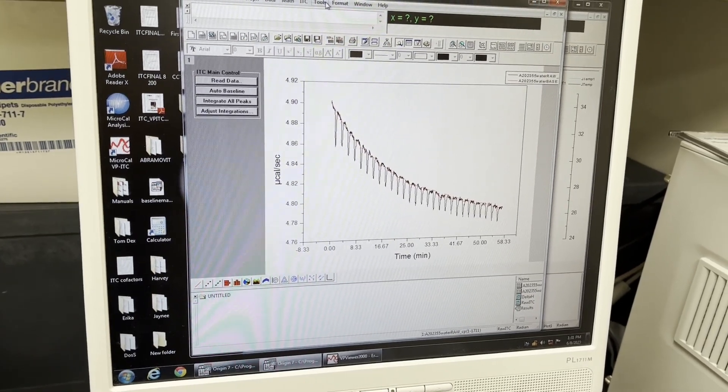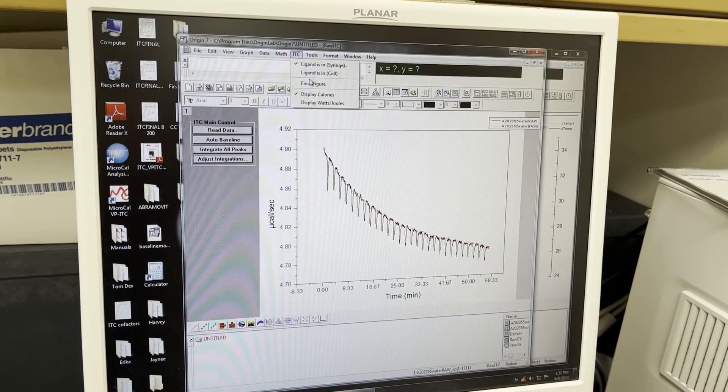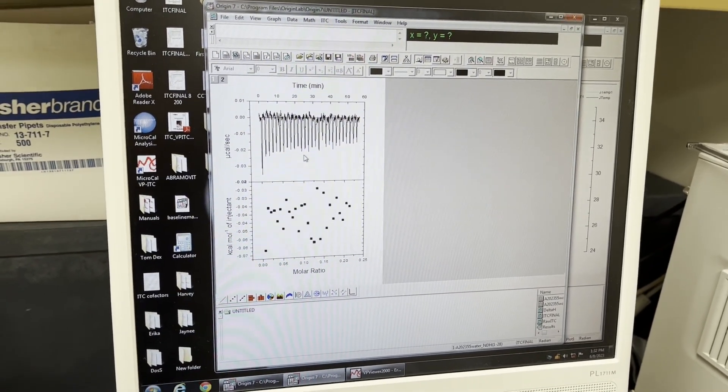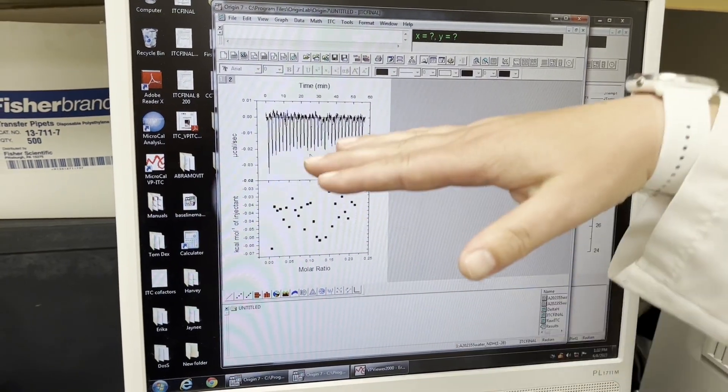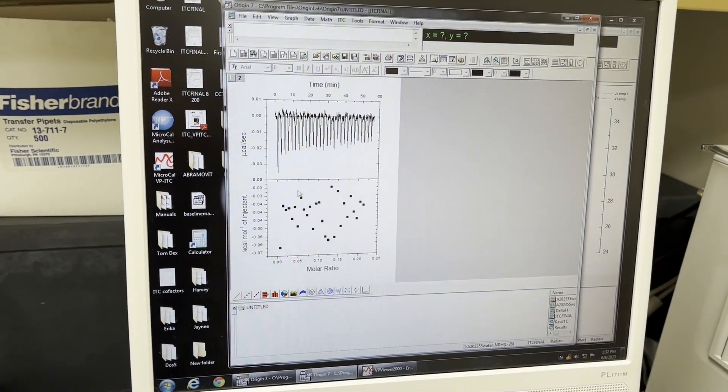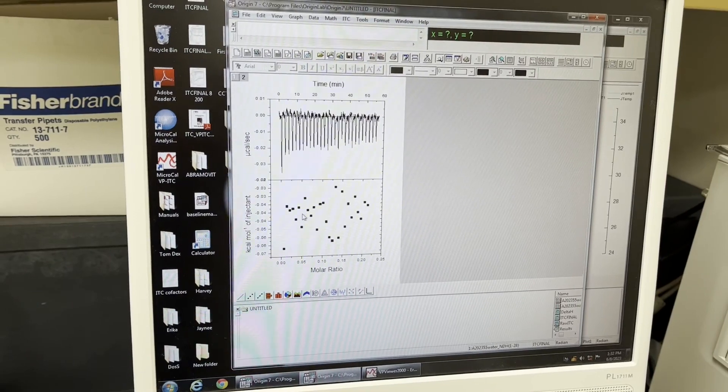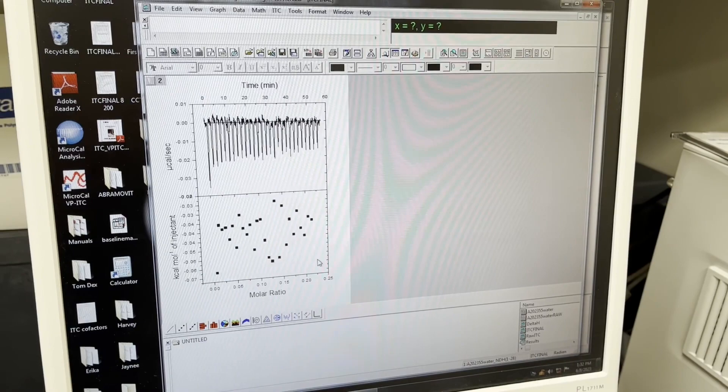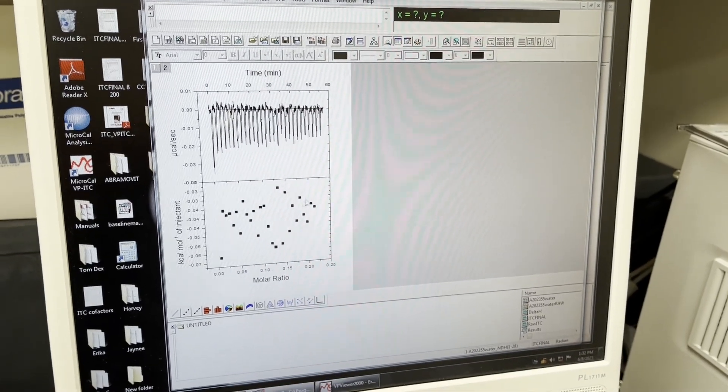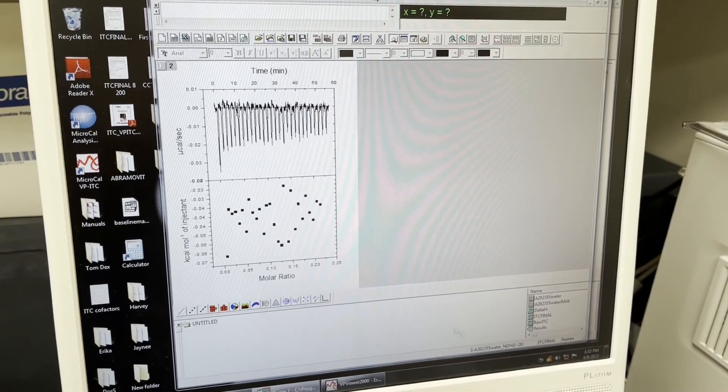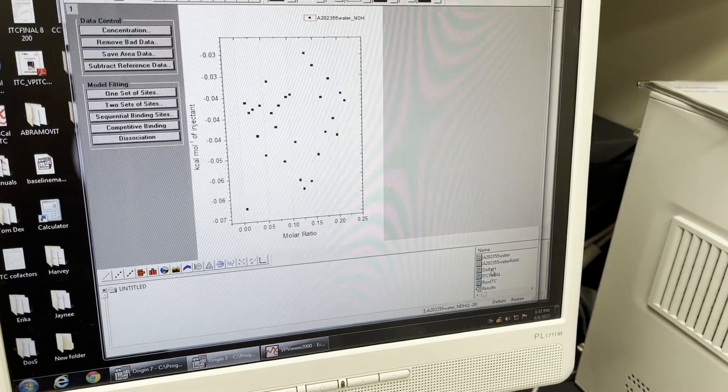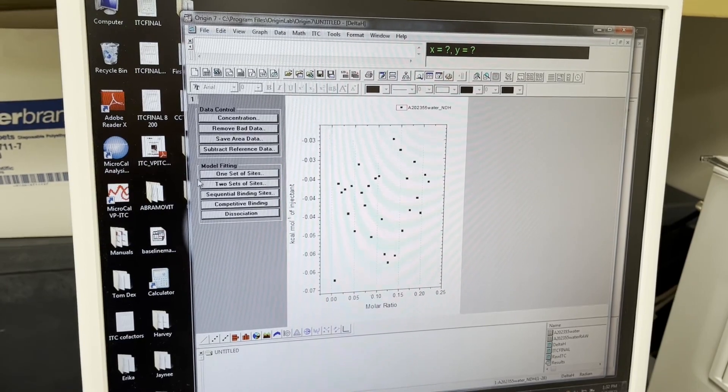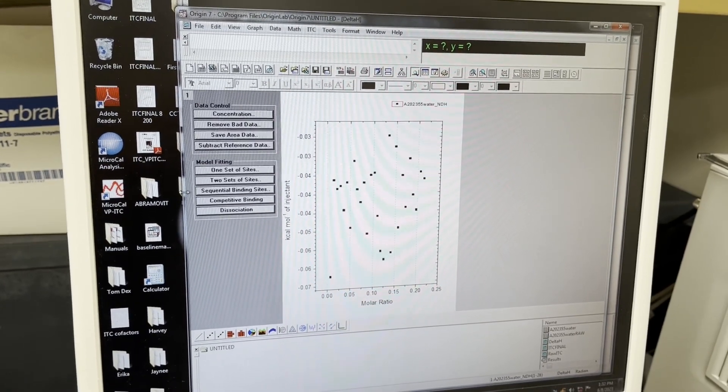If you would like to go to a final figure, go there where you have your raw ITC on top and you see how it nicely brings up the baseline. Since this is water water, this is all scatter, you don't really need to fit the data. However if you would like to fit the data, let's say you actually have a beautiful binding curve. You can make sure you're on the delta H window.